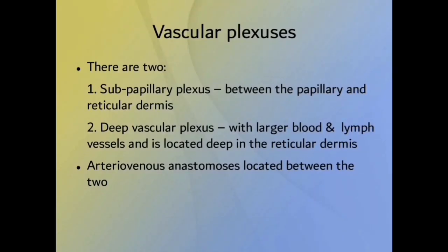Let me talk a little about the hypodermis. Okay, so the hypodermis, we do not consider it part of the integumentary system, but however it lies deep to the dermis. It is mainly composed of loose connective tissue, mainly filled with adipocytes. So we'll find that some of the structures in the dermis will end or will be located in the hypodermis as well.